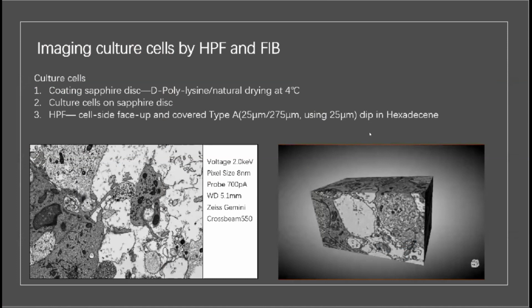Oh yeah. I always prepare it before my experiment. I prepare the sapphire disc, and when I use it, I take it out.